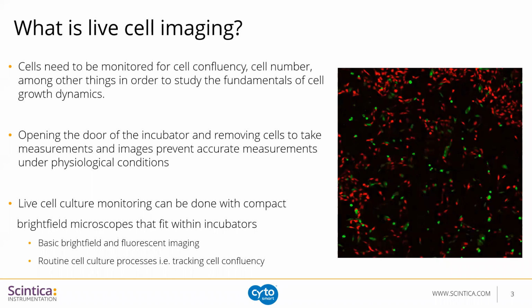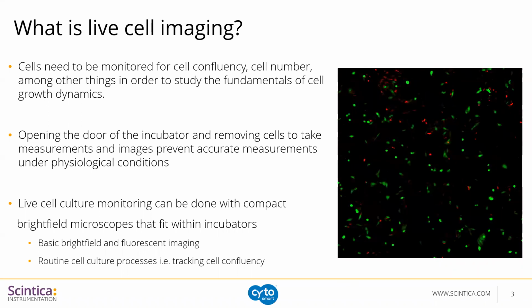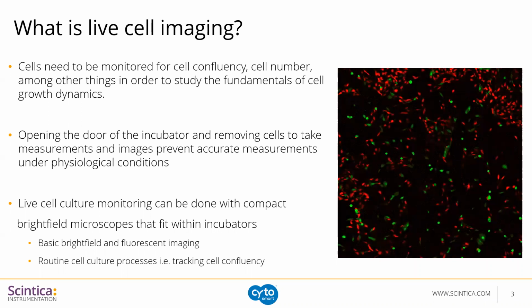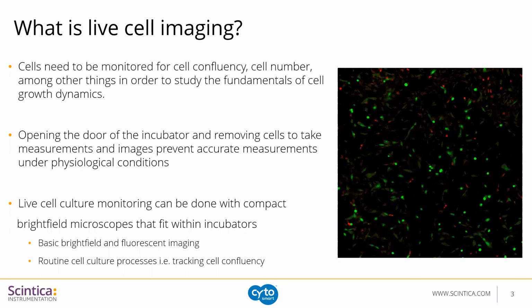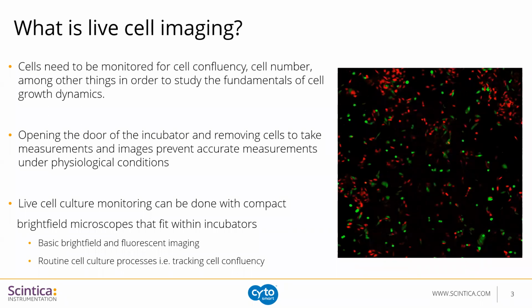Okay, so jumping right in. So what is live cell imaging? Live cell imaging is the study of living cells using time-lapse microscopy, and it's used by scientists to obtain a better understanding of biological function through the study of cellular dynamics.